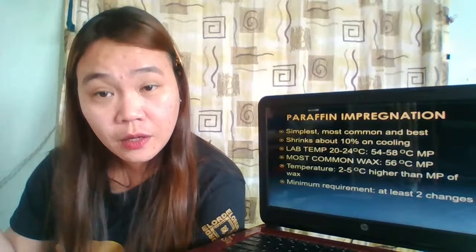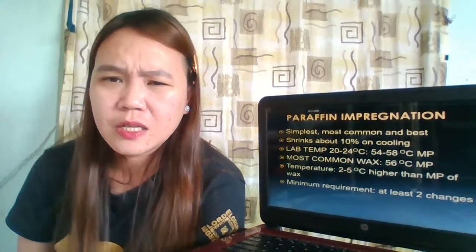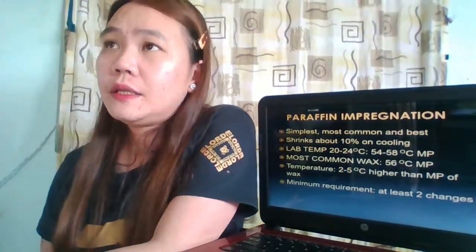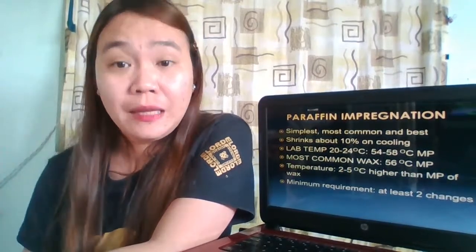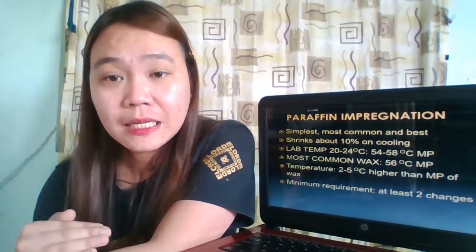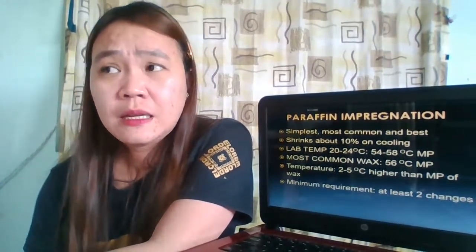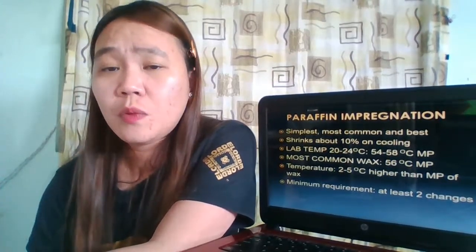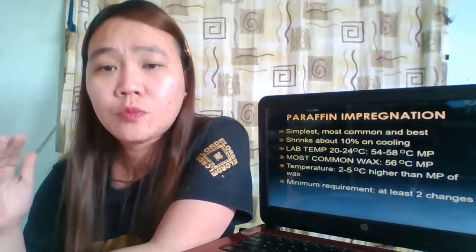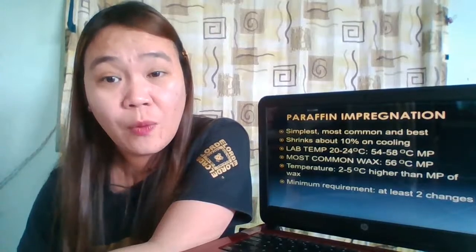For impregnation and embedding, you have to take note of the melting point of your waxes, because all of these steps that we perform in tissue preparation are for us to produce a tissue section, a tissue section that is of diagnostic quality.